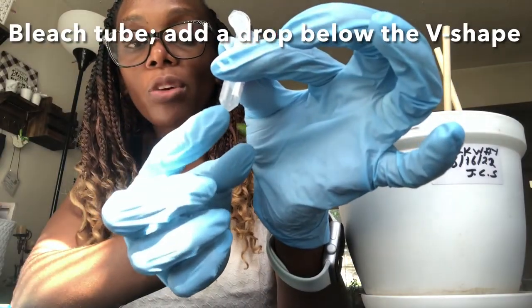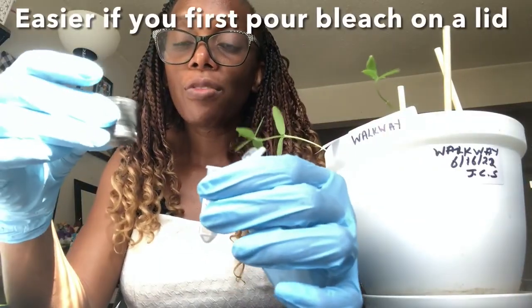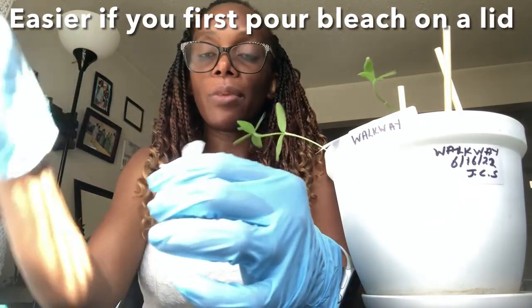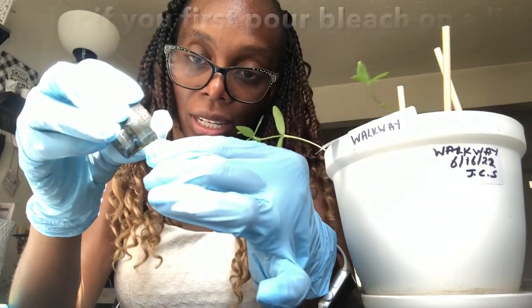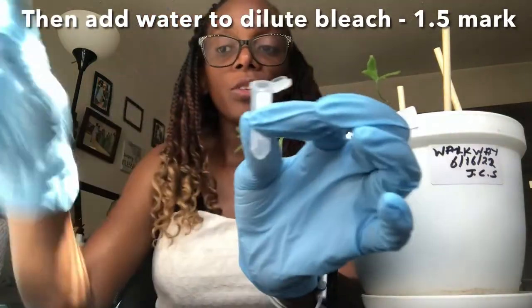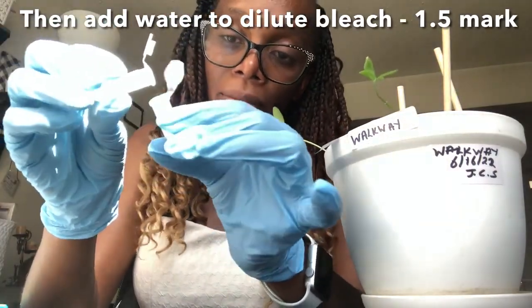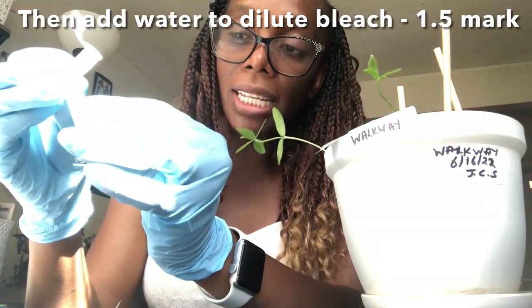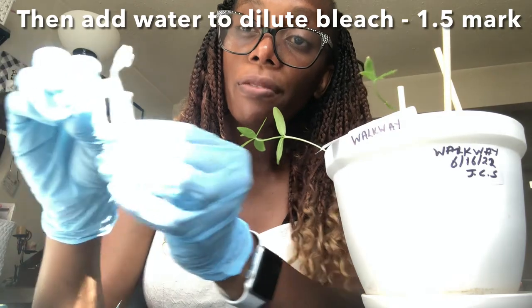Okay, so you want to have very little, like a drop of bleach, and it's easier if you put it on a lid, like I have mine, because the container is really big, and when you pour it, you might end up pouring too much. So I'm just going to put very little of it. All right, and then my next part is I have to add water. It's actually easier if we add water from the other tube, and then we can get some more later. So in this case, because mine is like 8%, I'll put this to the 1.5 mark.